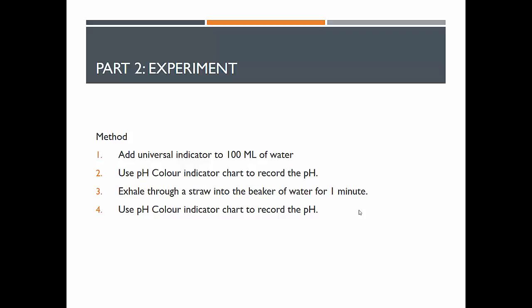So, safety first. Don't suck up the straw. You're blowing out. You're exhaling. You're not inhaling. We don't want you to consume any of the liquid in the beaker. And it's not like you're trying to blow the world's biggest bubbles. You've got a beaker of liquid with the universal indicator in it. You just want to blow a steady stream of bubbles, making sure that the gas from your breath is circulating through that beaker of water.